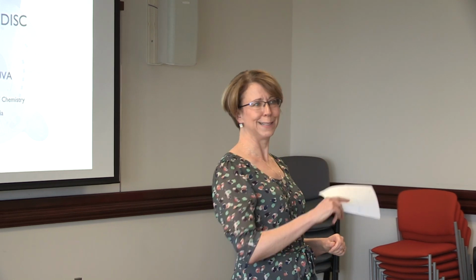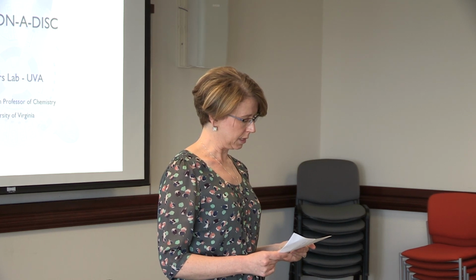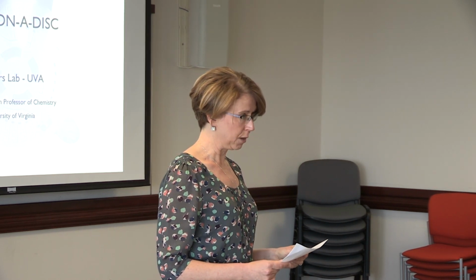Today we're going to hear a super cool talk about how James Landers' lab has taken what is actually a really complicated forensic process, for all of you CSI and NCIS viewers, and put it onto something the same size as what we all, if we're old enough, remember: a CD in the Sony Discman players that we used to walk around with. This is really fascinating research, and we're very pleased to have James here.